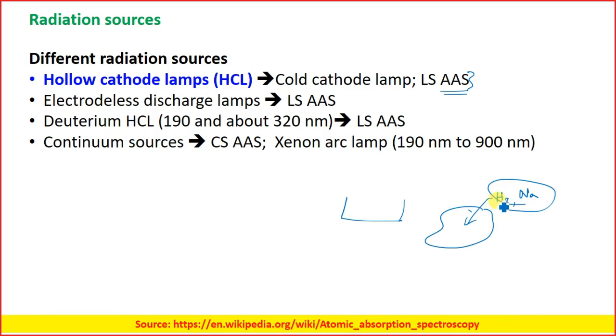Whether it is biomedical or environmental, you first have to understand what you are to analyze. If you want to analyze sodium or potassium, and know whether these metal ions are present within these systems, then you have to choose which kind of analysis you want to do.